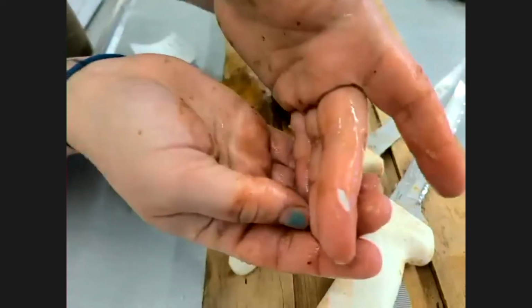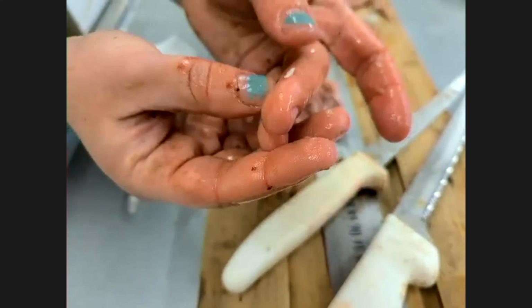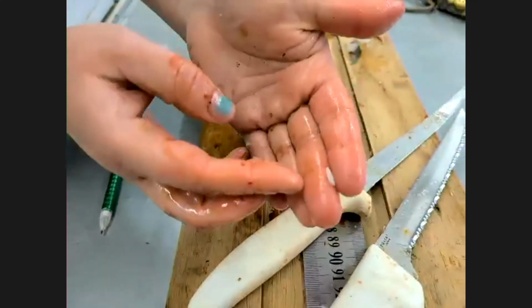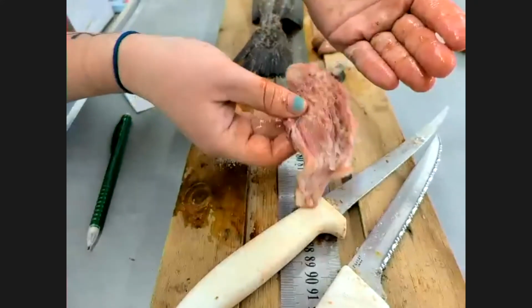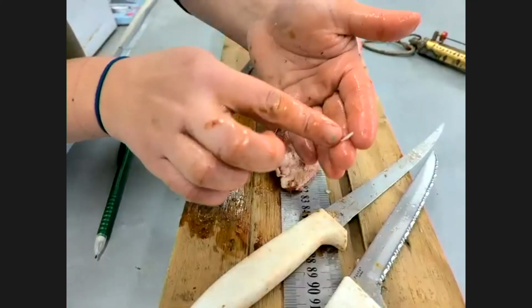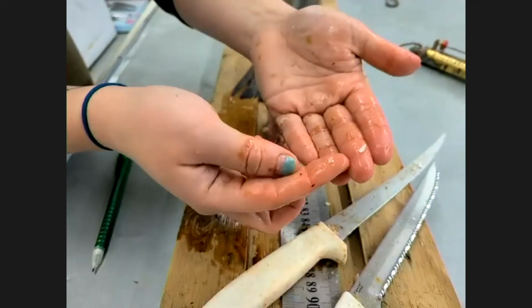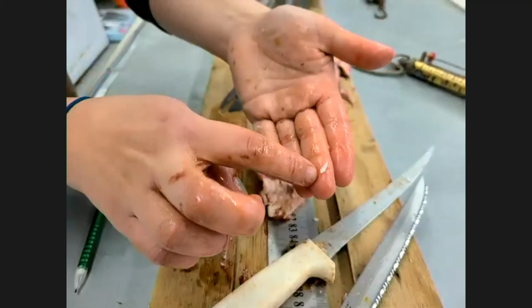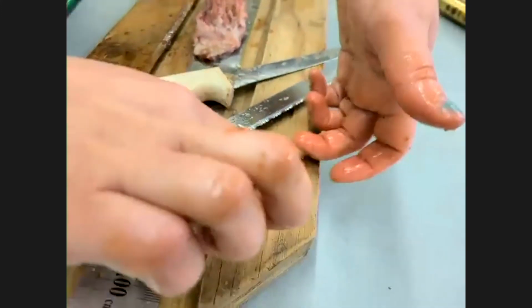this is an otolith. So this fish ate another fish. Because that right there is an ear bone that we were just looking at, but that came from a much smaller fish. Obviously if you're looking at this stomach, I can't tell just by sight what this came from, but we can analyze otoliths. I could send this in and we could find out what kind of fish it had been eating. Of course, these hard parts are generally what stick around longer than all the soft, squishy parts.